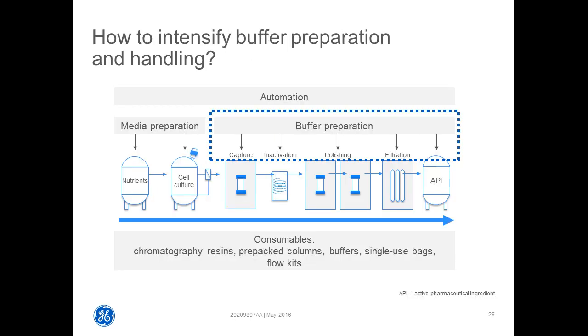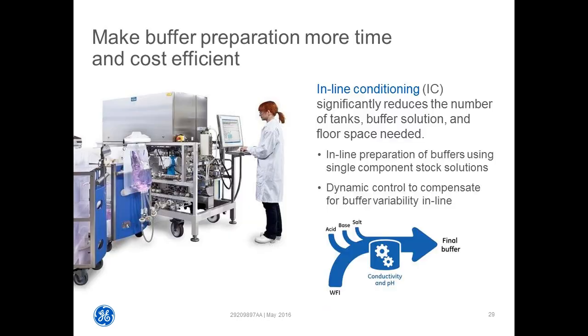A related topic to straight-through processing, especially as it relates to formulating and handling buffers, is something called inline conditioning. Inline conditioning is just a fancy term for how you automate and make the process of buffer preparation and buffer handling more intelligent.